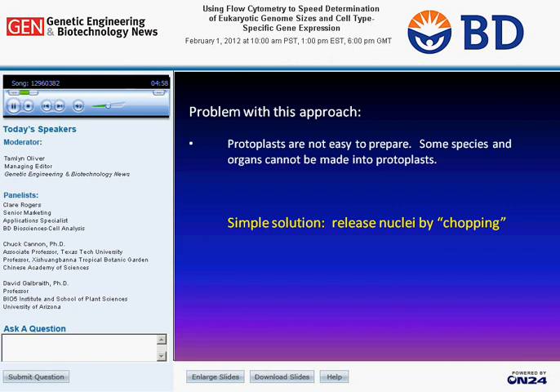And we devised a method of doing this, which was a high technology approach, taking a single-edged razor blade and chopping up the plant material. And this makes a homogenate, as you'll see in the next slide.